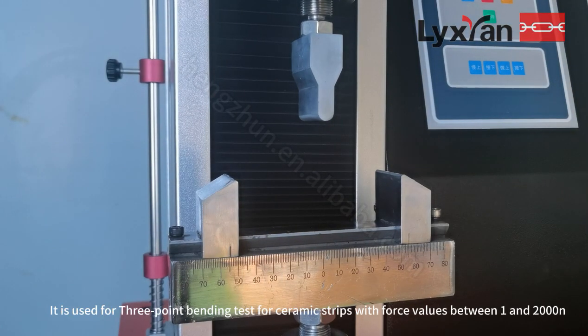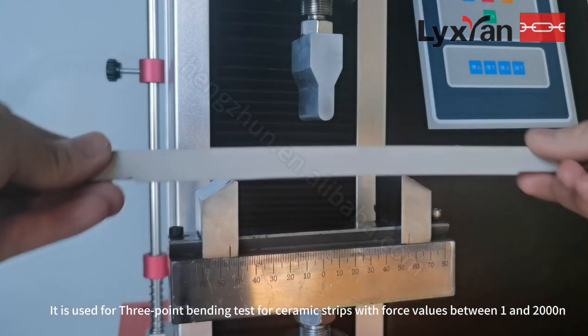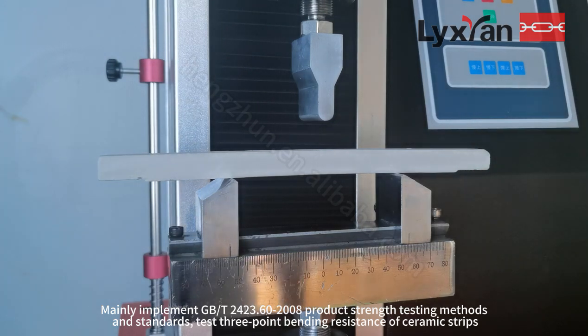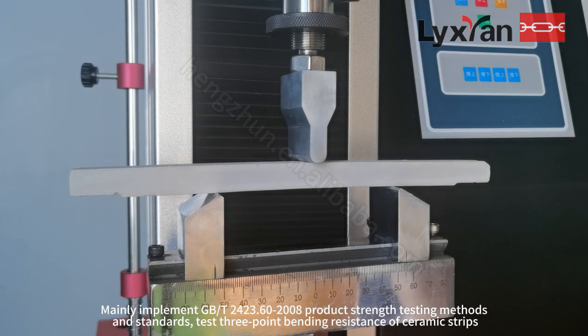It is used for 3-point bending tests for ceramic strips with force values between 1 and 2000N. It mainly implements GB/T 2423.60-2008 product strength testing methods and standards.